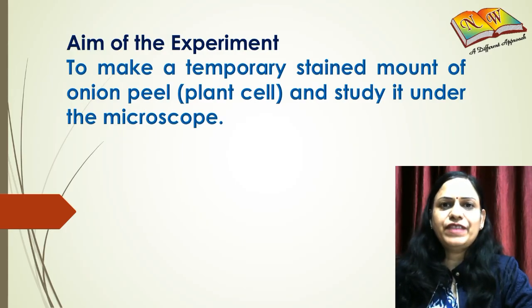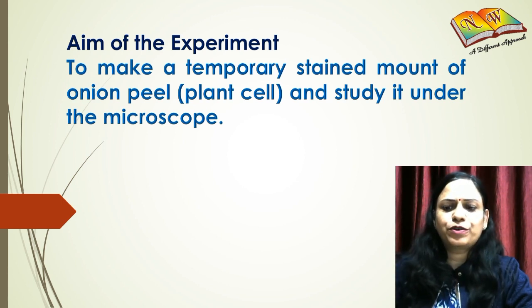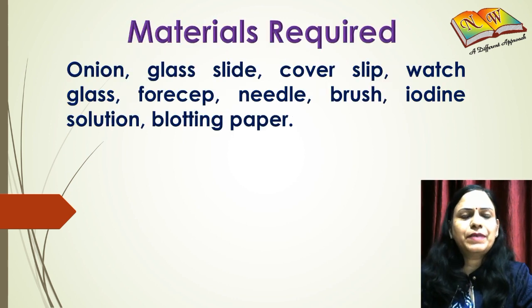In this experiment we are going to prepare a temporary stained mount of onion peel and study it under a microscope. The materials required would be an onion, a glass slide, cover slips, watch glass, forceps, needles, brush, iodine solution, and blotting paper.